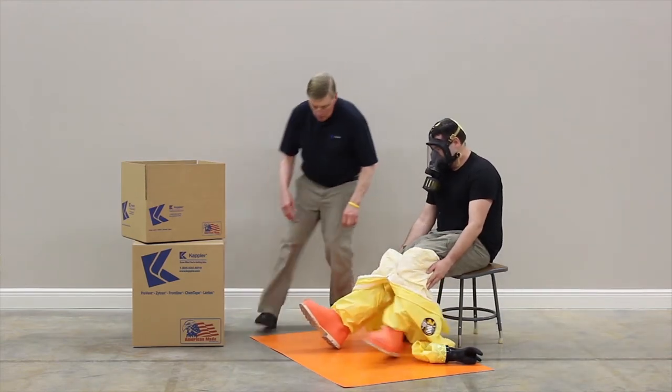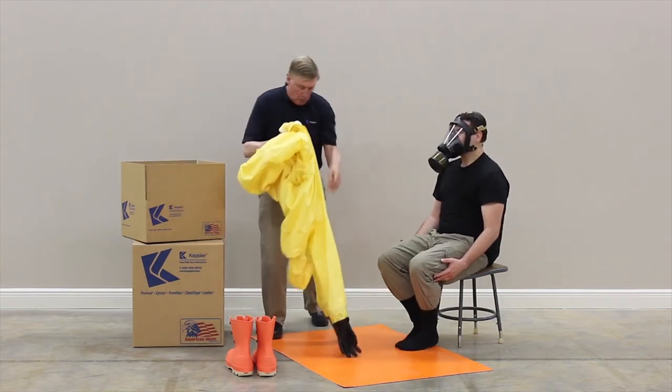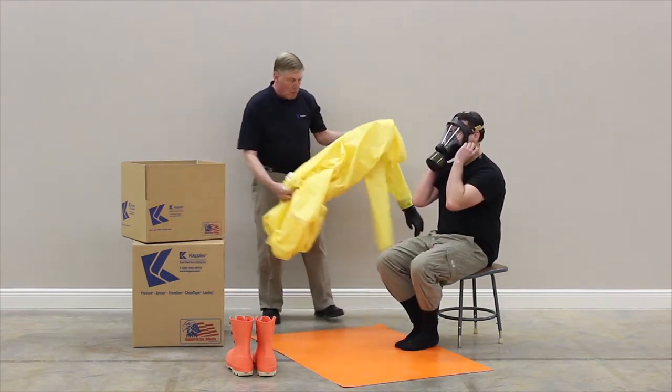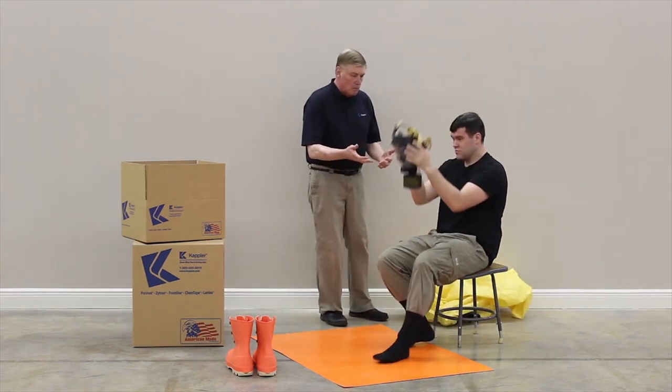Remove each outer boot. Once the garment has been completely removed, the wearer can safely doff the respirator face piece.